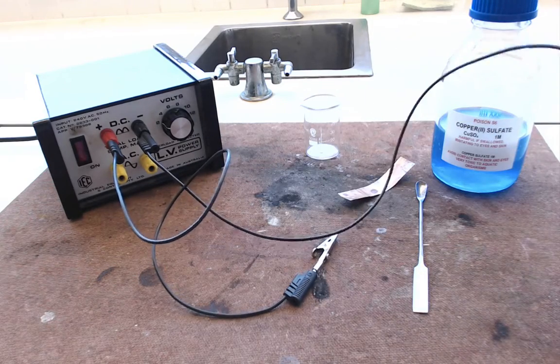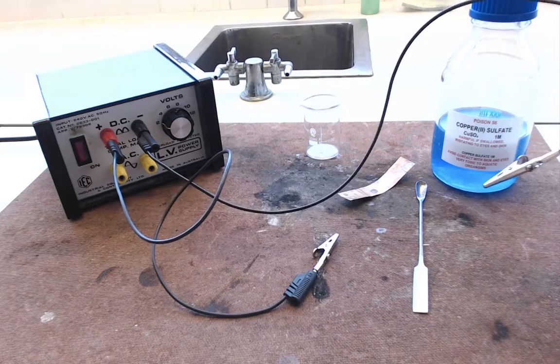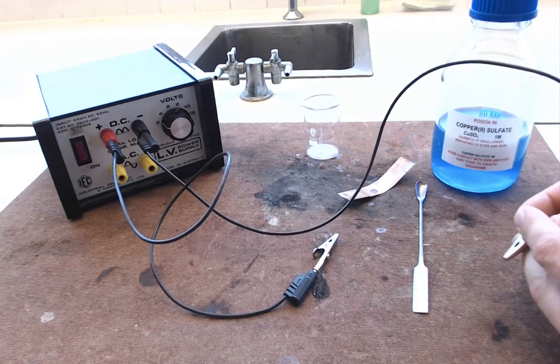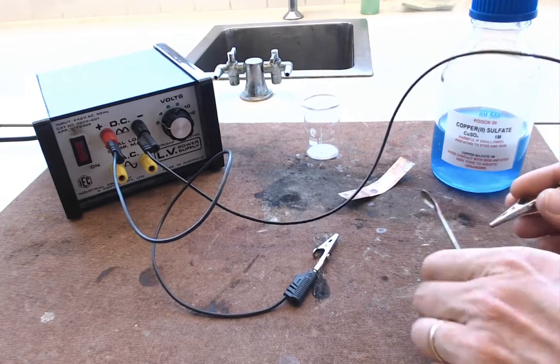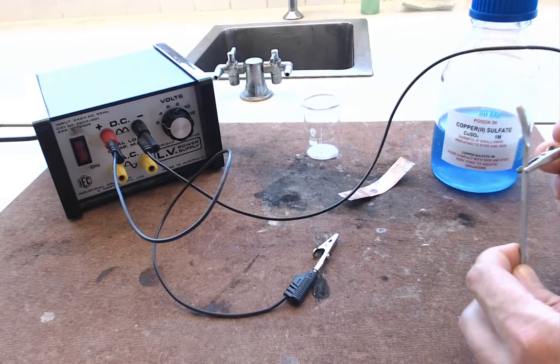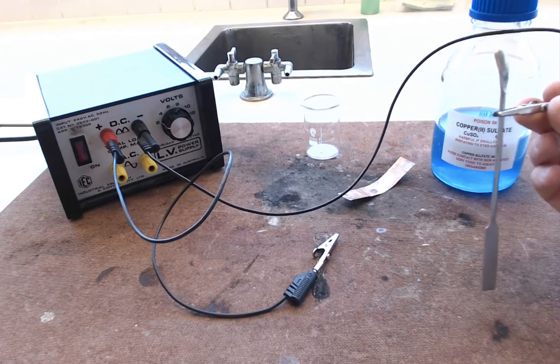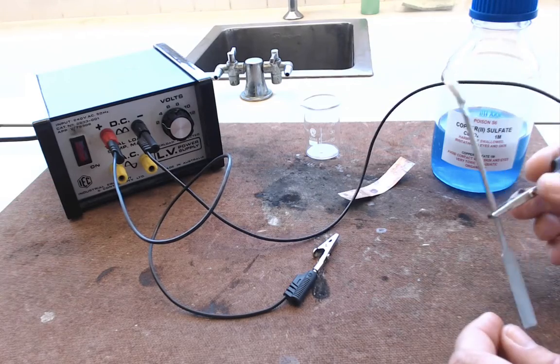So find your negative electrode. That's the one connected to the black terminal on your power pack. That is going to be connected to the object that you're going to try and plate with copper. So I would attach it to my spatula in this case.